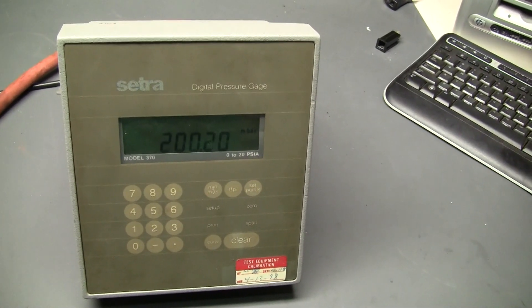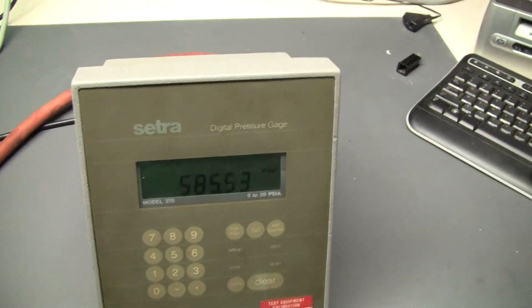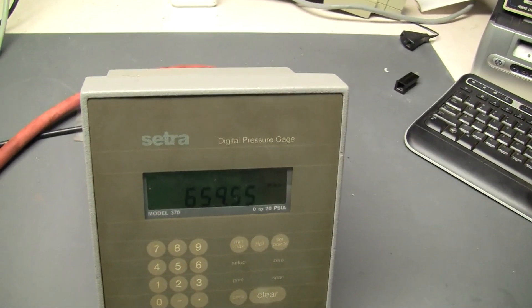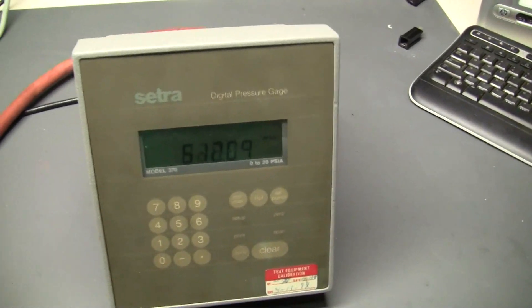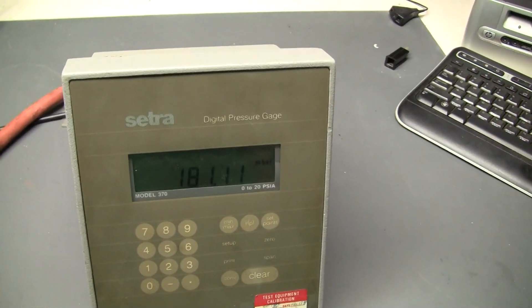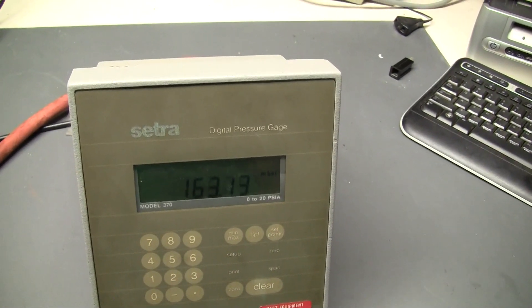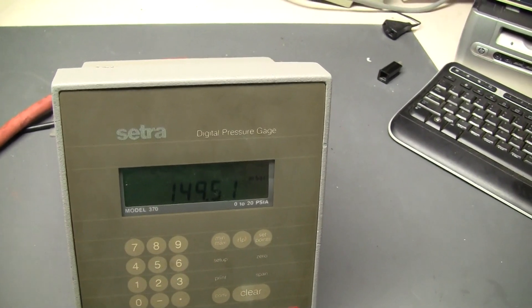We've got our load on our sensor. We don't have the best seal here, but we can get an idea of what kind of vacuum we're going to see out of this. There we go — 150, 160, 145.